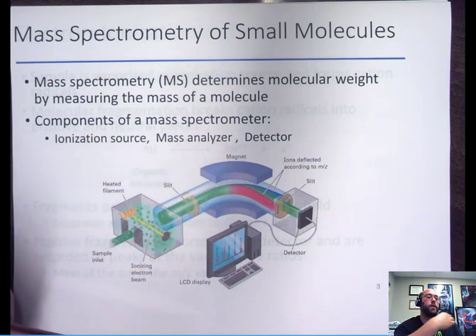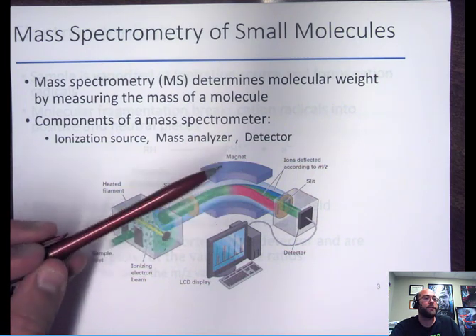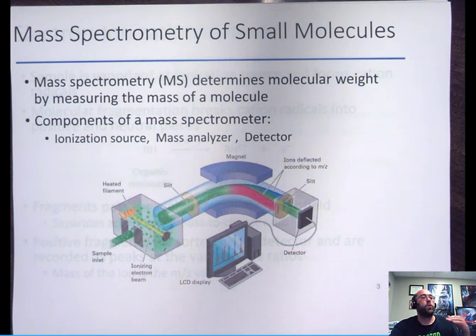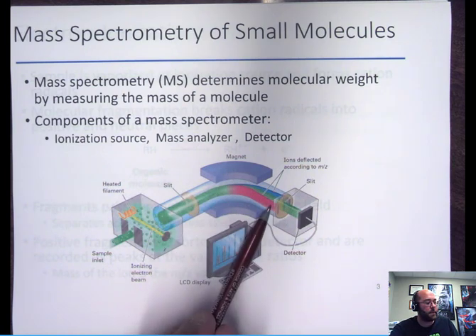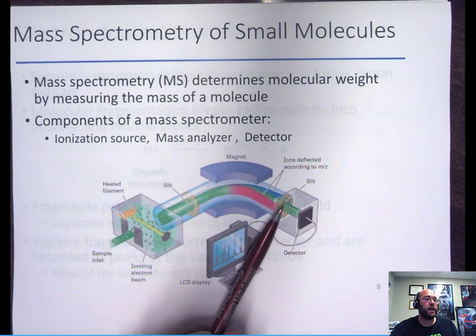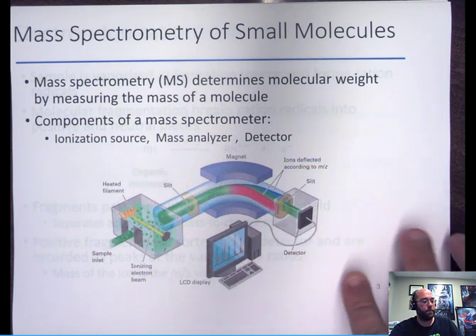These ions have different masses, so therefore they have different weights, so to speak. But they're also charged, so they will actually feel this magnet. So the fragment, based off of its charge and its mass, will have its path deviated once it feels the presence of this magnet. And so that's what's utilized here in getting a bunch of different fragments or peaks in your mass spectrum.